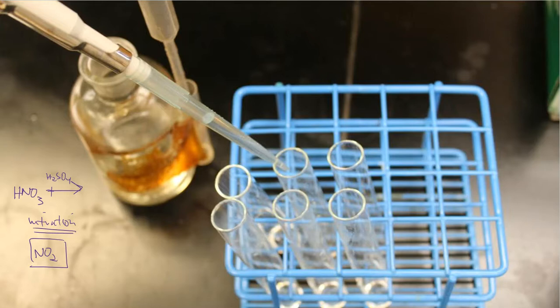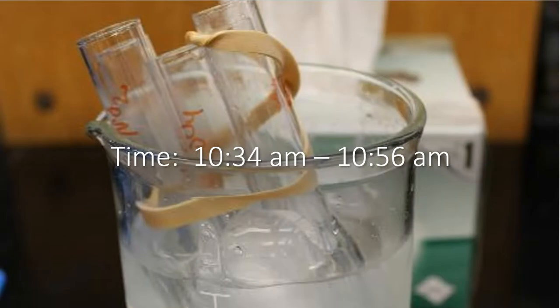All right, now, the directions told me to take these tubes and get the acids really, really cold. And that's what I did. So I grabbed my test tubes up together. I labeled them so I know which one was which. I put a rubber band against them to keep them together. And then I put them into that ice water bath, 10:34 to 10:56 that morning.